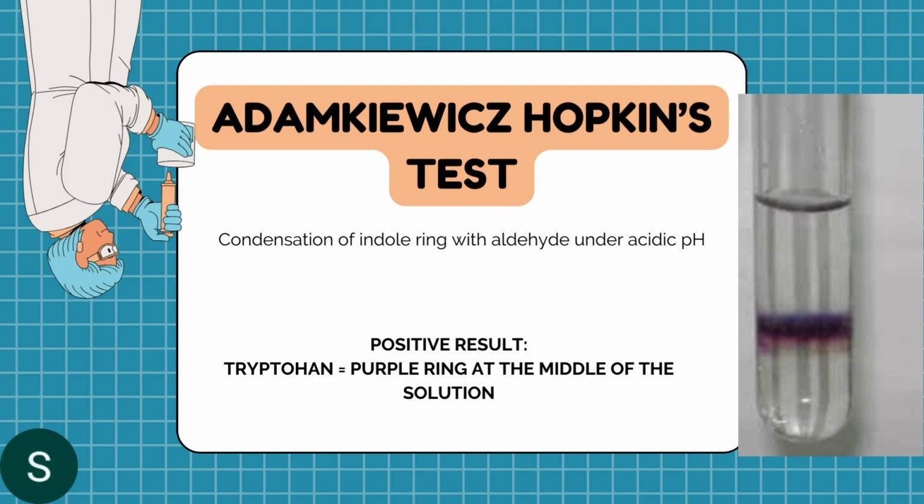Okay, so next we have your Adamkiewicz reaction. It is part of a biochemical test used to detect the presence of the amino acid tryptophan. This is the condensation of your indole ring with an aldehyde under an acidic pH. When concentrated sulfuric acid is combined with a solution of protein and glyoxylic acid, it produces a purple color. It was named after its discoverer, Albert Wojciech Adamkiewicz.